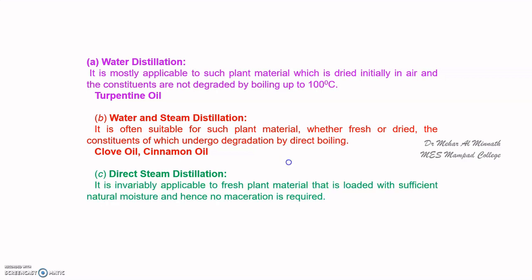And the direct steam distillation method is applicable to fresh plant material that is loaded with sufficient natural moisture. We need not macerate it. That is, we need not immerse it in water before distillation.